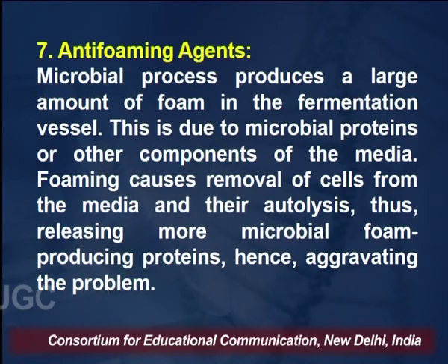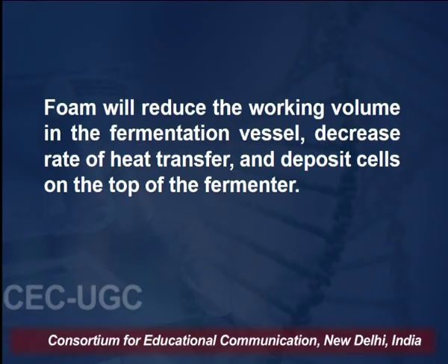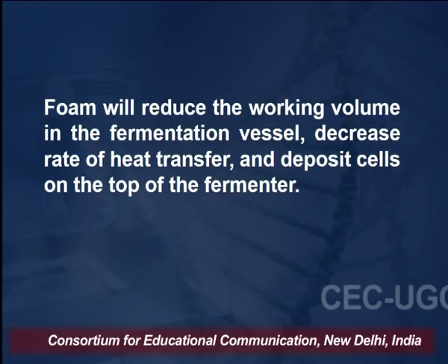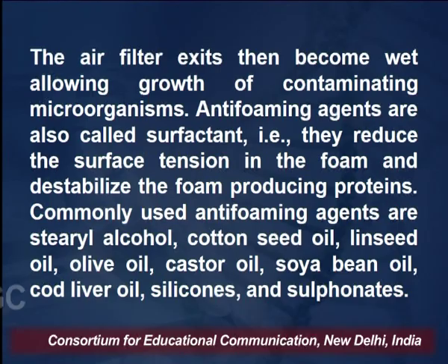Antifoaming agents. Microbes produce a large amount of foam in the fermentation vessel. This is due to microbial proteins or other components of the media. Foaming causes the removal of cells from the media and their autolysis, thus releasing more foam-producing microbial proteins and aggravating the problem. Foam will reduce the working volume in the fermentation vessel, decrease the rate of heat transfer and deposit cells on the top of the fermenter. The air filter gets wet, allowing the growth of contaminating microorganisms.